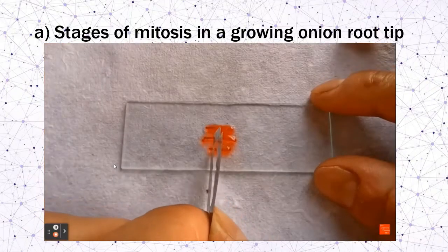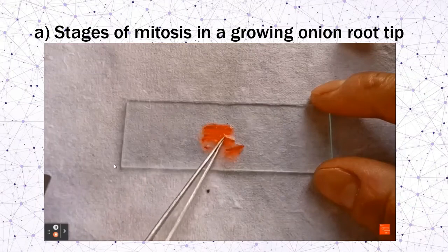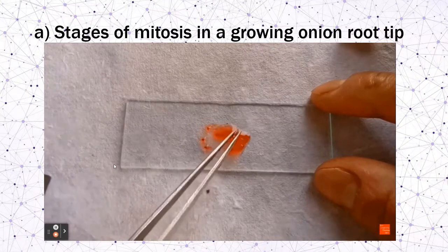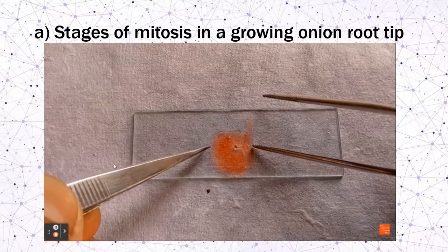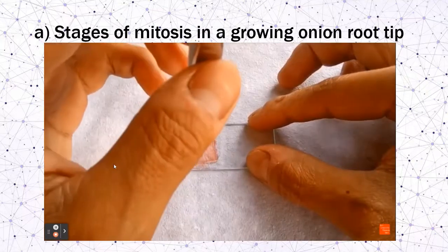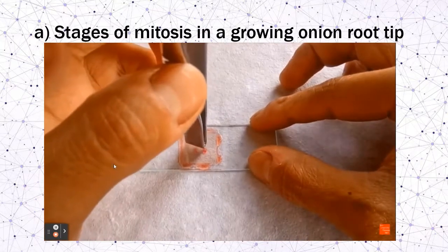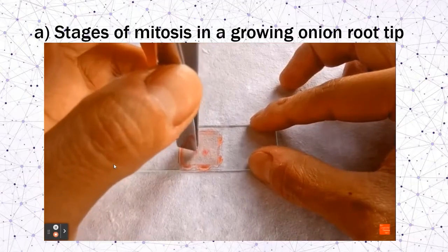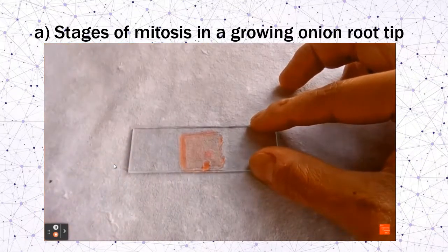Transfer the stained root tip onto a wet clean slide with one drop of water. Using a blade, remove a few millimeters of the tip. Gently lower the cover slip and avoid air bubbles. Using a blunt instrument or pencil, gently tap the cover slip a few times until the root tip is uniformly squashed, then observe under the microscope.